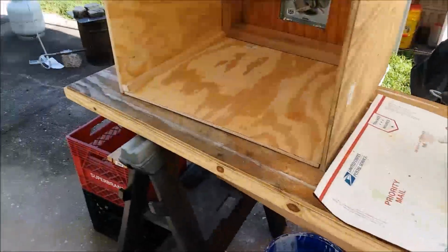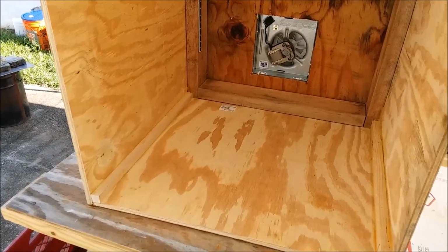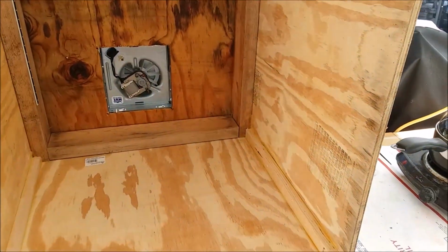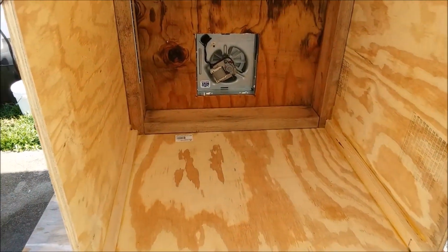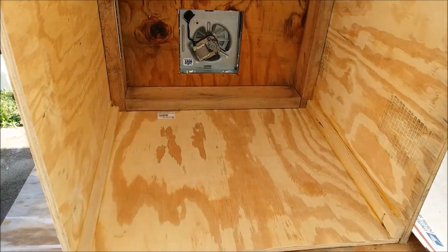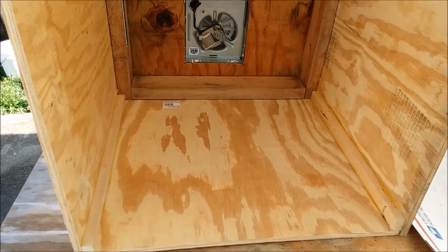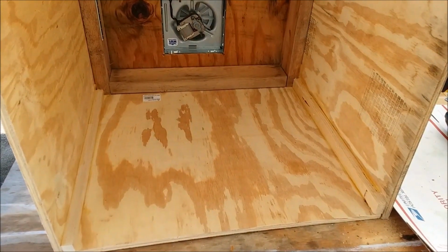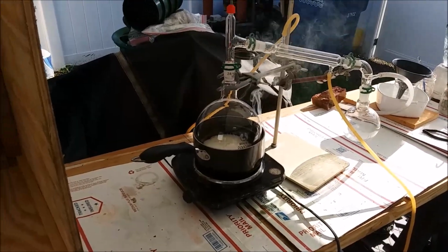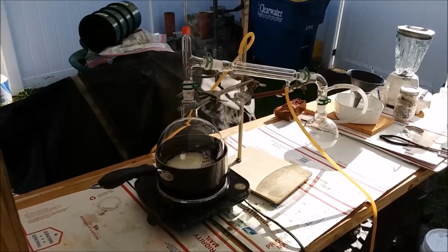One project I'm working on is painting the inside of my new fume hood I've built. It's somewhat for protection from splashed chemicals, but mainly I'm going to paint it white just to make it lighter in color inside, so that the LED strip lights I've installed up in there do a better job of lighting up the inside of it. The light will bounce around in there and everything will be brighter and lighter. So I'm going to get a couple coats of white paint on it while I'm babysitting this increasingly smoky reaction. It'll burn off eventually.